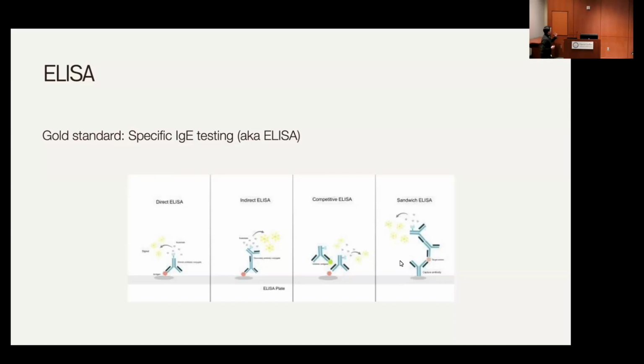So now jumping in, the simplest subtype of ELISA is the direct method. The direct method is very straightforward. We can just coat the bottom of the well with an antigen, and then we'll introduce the enzyme-linked antibody. And then after that, we'll go ahead and wash.